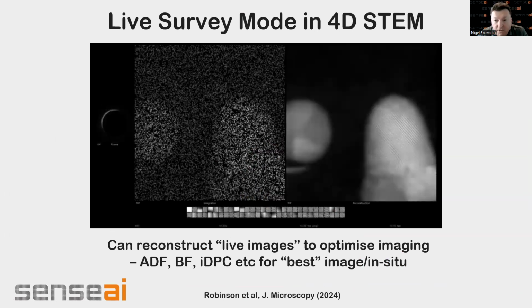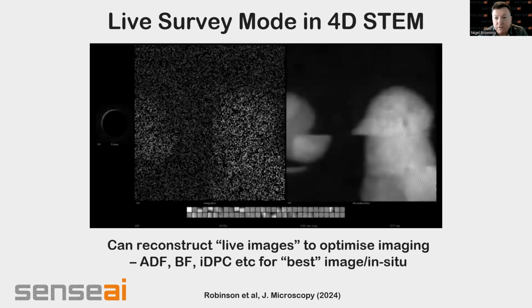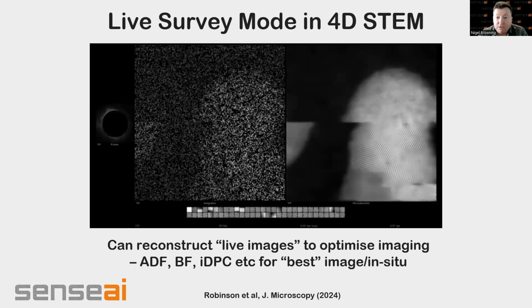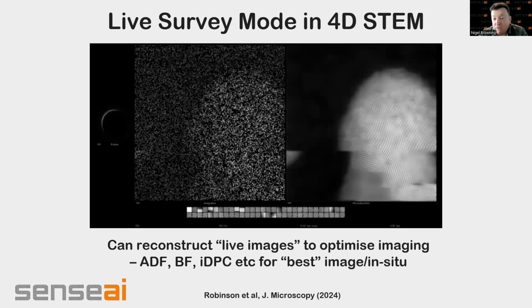Now, in this case, it's not moving as fast as it is in real life because the signal is being processed through the whole control software system. But essentially, we're getting several frames per second that comes out of that. We can change the magnification. We can see that we can reconstruct the image very clearly. You can see changing magnification doesn't affect the speed of the reconstruction, so we can go through and do that. We can go to higher magnification, lower magnification, get the image to come out.